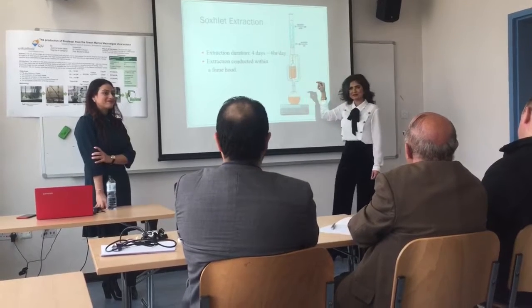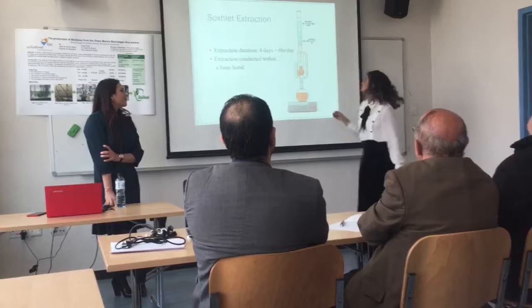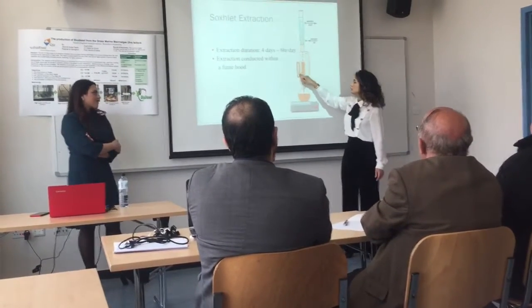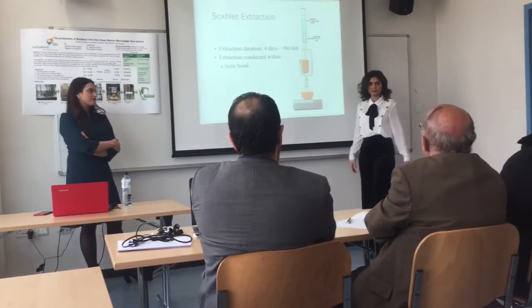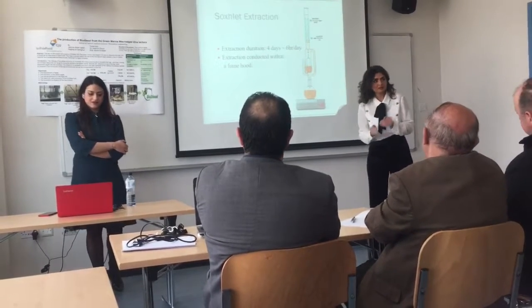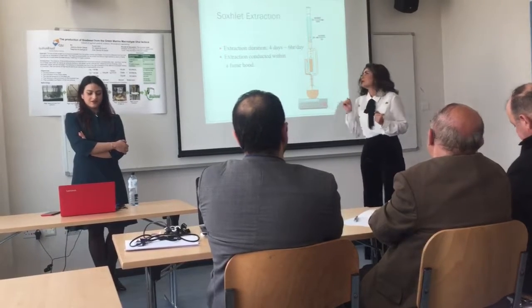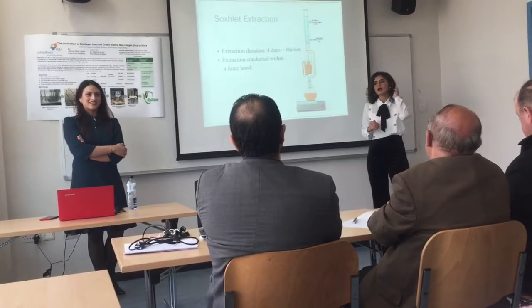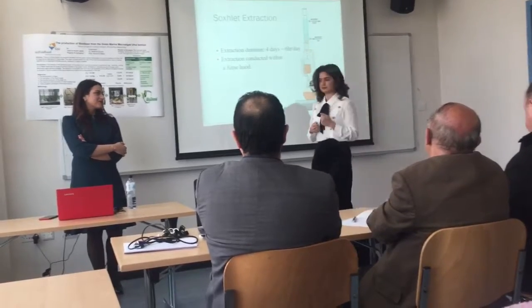The warm n-hexane will extract the oil from the algae, and as the extractor fills almost full, it will empty through the siphon back to the distillation flask. It's a continuous procedure. In our case, it took 4 days, 6 hours each day. And of course, the extraction was conducted in a fume hood to protect ourselves from hazardous fumes or vapors.